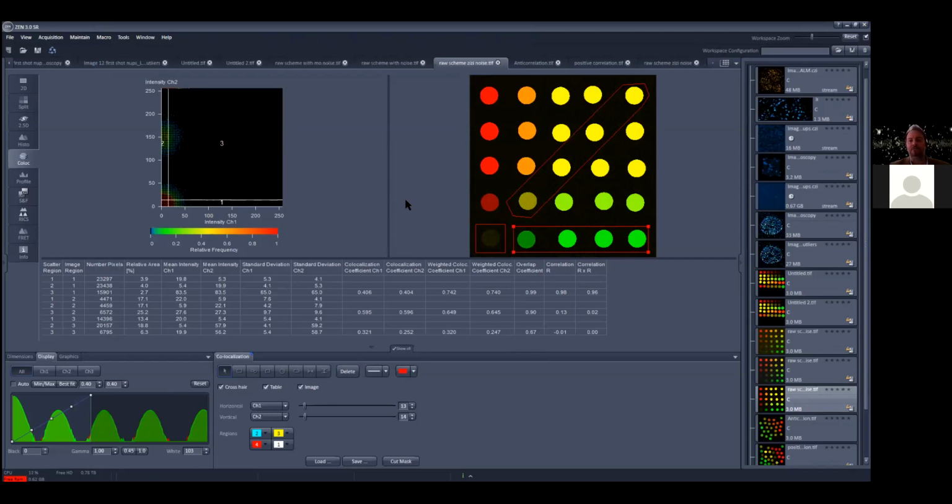Over to you, Doug. That was good, Chris. I actually didn't realize a lot of the stuff that you could do. I like how you can highlight specific areas in your image, and then I can show that on the histogram or vice versa.